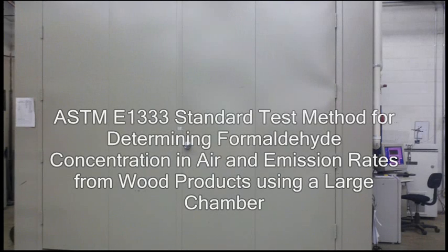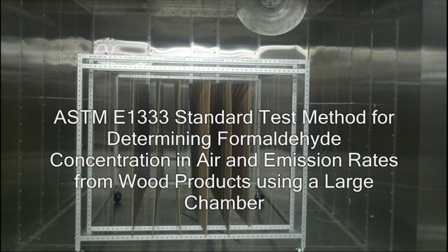This video covers the test method ASTM E1333 for determining formaldehyde concentration in air and emission rates for wood products using a large chamber.